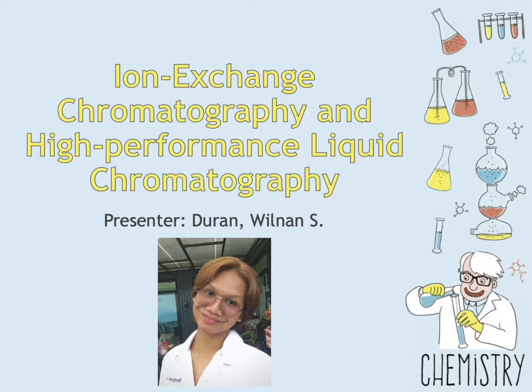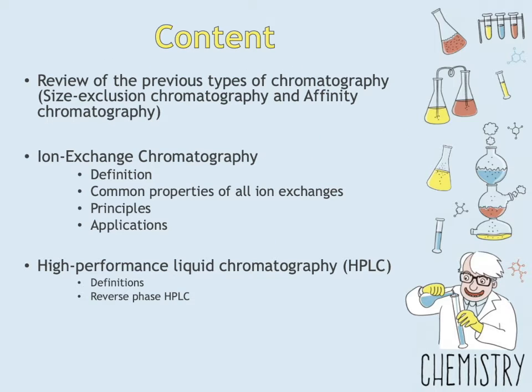Before anything else, let me present to you the content of this presentation. First, we will review and recall the previous types of chromatography, which are the size exclusion chromatography and affinity chromatography. After that, we will then discuss one of the main topics of this presentation, the ion exchange chromatography, and we will go through its definition, common properties of all ion exchanges, its principles, and applications.